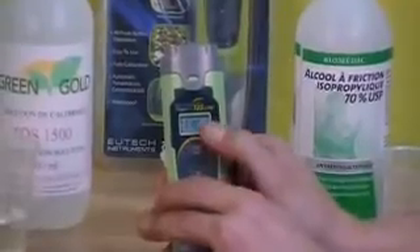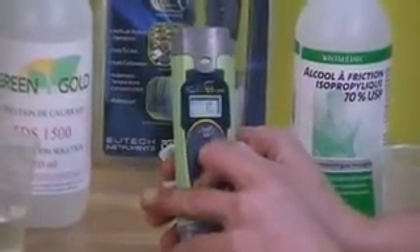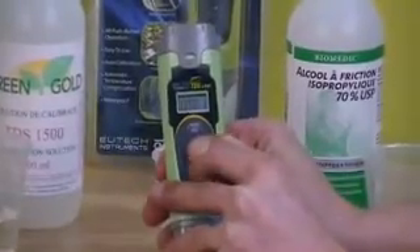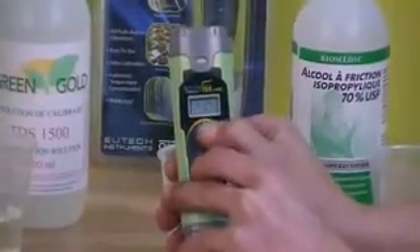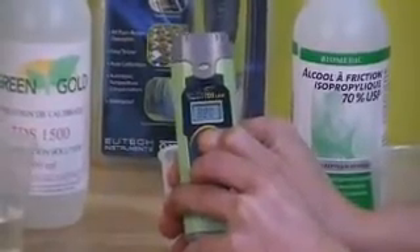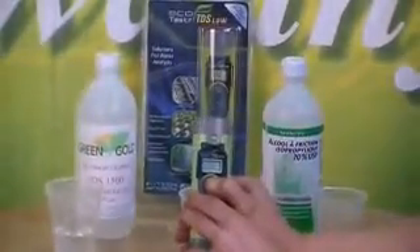On your screen it should flash FAC — that's your factor number. It's going to say 0.710, and you're going to have to change that to 0.510. You change it by pressing the hold enter button. It will only go up; you cannot make it go down, so just go all the way up and it should come right back down until you reach 510.